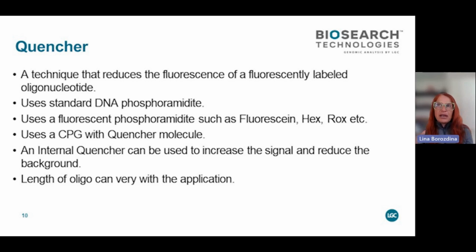For different applications or different pairings of fluorophore and quencher, you will play around with a different length of your oligo as well. But those oligos are no more than 30-mers, 35-mers, so this is easy to make. And as I say, having your own capabilities in the laboratory and not waiting for weeks and months for something from an oligo house has been very beneficial during the last few years for people.